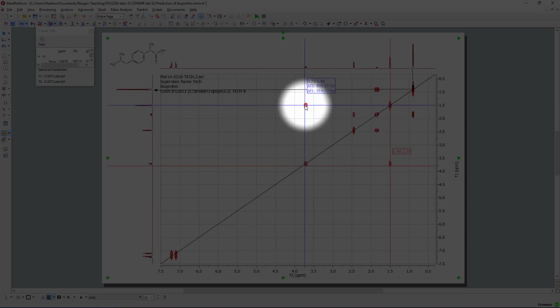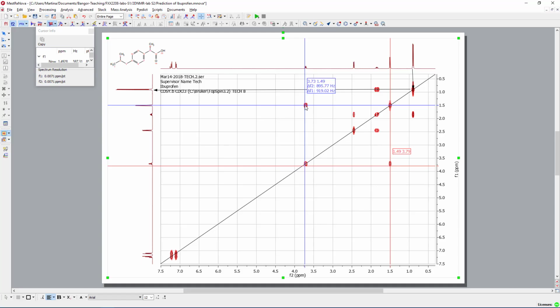So now you can clearly see where the CH3 group is sitting. It's roughly at 1.5. To the side you have a window. If it were a bit bigger, then you could see it. It just peeks out there at 1.4928 with 4 decimals. So by this we have basically found this connectivity.